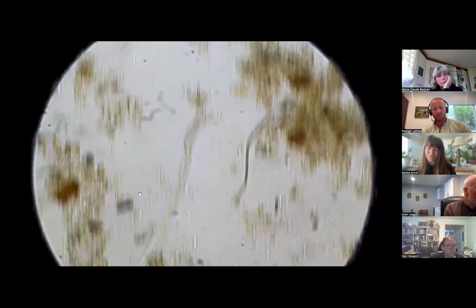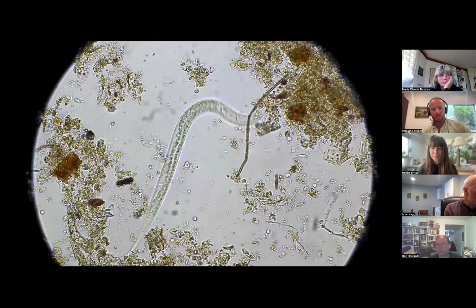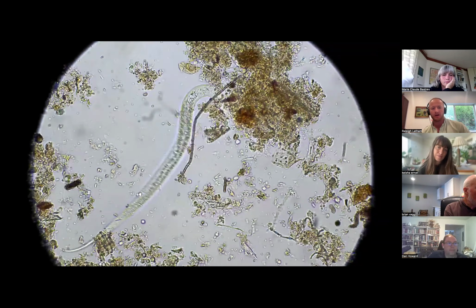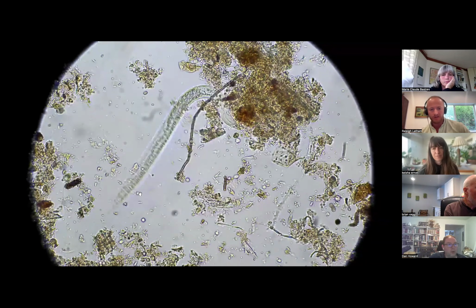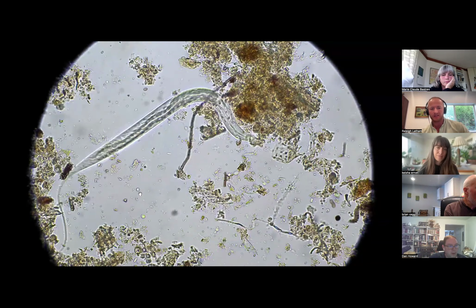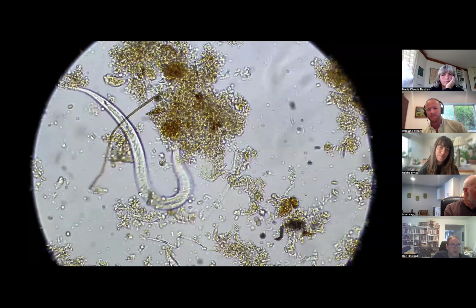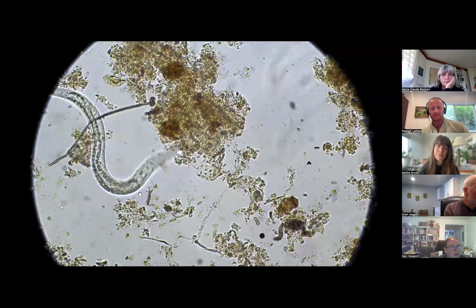That's one thing I really love about all of this: you see this diversity in the microscope and you can save that in your mother pile to then keep increasing and keep adding nematode extracts. And then when you need to make massive large scale extracts, you have that diversity in your mother pile. And it's so cool.